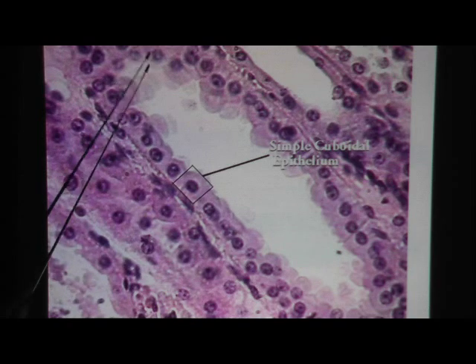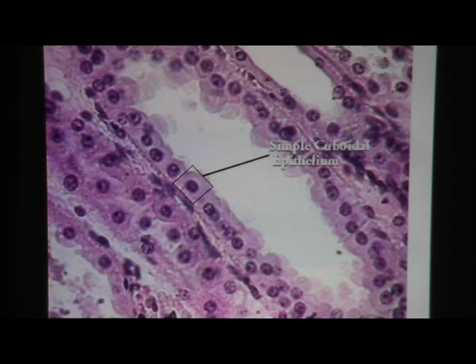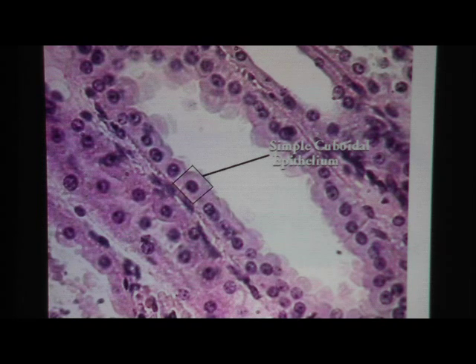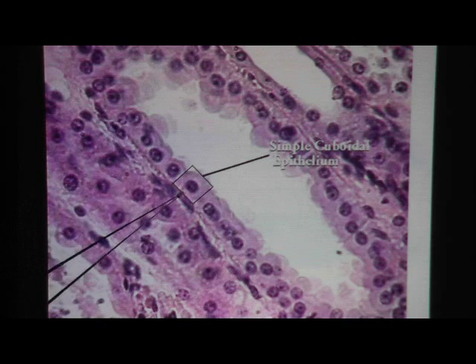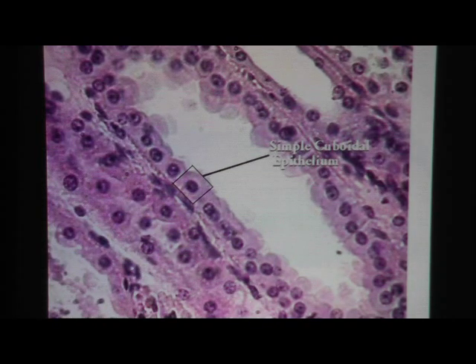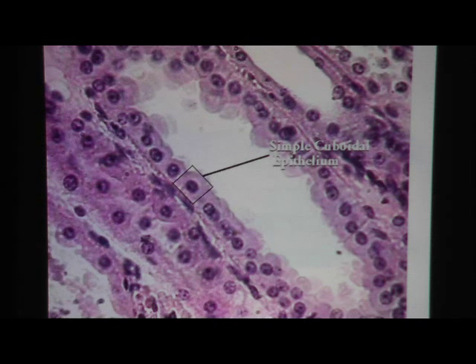Does the orientation matter? The white space should tell you you're looking at epithelial tissue. Once you see epithelial tissue, ask yourself the two questions: number of layers and shape of cells. Here you can see this is only one cell layer thick — the basement membrane is visible on one side. The general shape of the cells is like a square, so this is simple cuboidal epithelium.